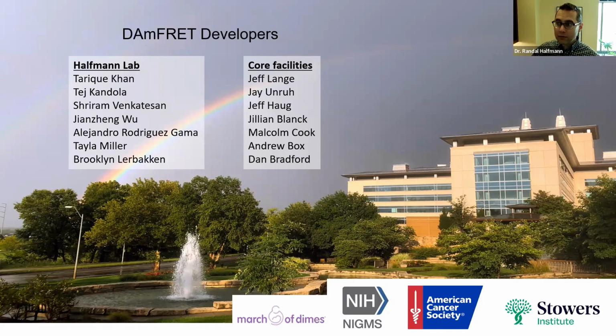And this is exactly what AlphaFold does, right? But AlphaFold does it with natural multi-sequence alignments. What our technology allows you to do, in principle, is to do exactly that same thing and use AlphaFold, but replace the multi-sequence alignment from the natural sequences with your artificially selected pool and obtain structure. So that's what excites me about this technology ultimately.